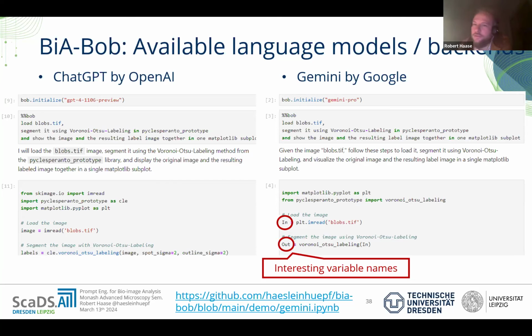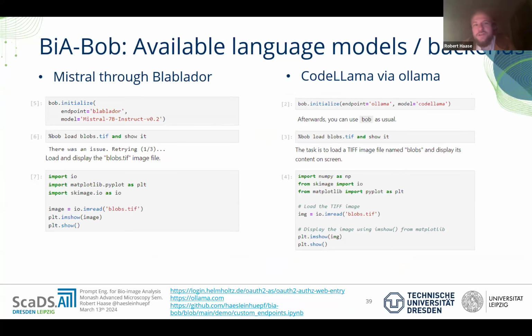But Google Gemini in this particular case is using weird variable names. I also sometimes see that import statements are a little bit different than a common Python programmer would write them. So I would say some unusual examples are in there. They may fix it over time, or it may just stay different for longer. That's all certainly possible.